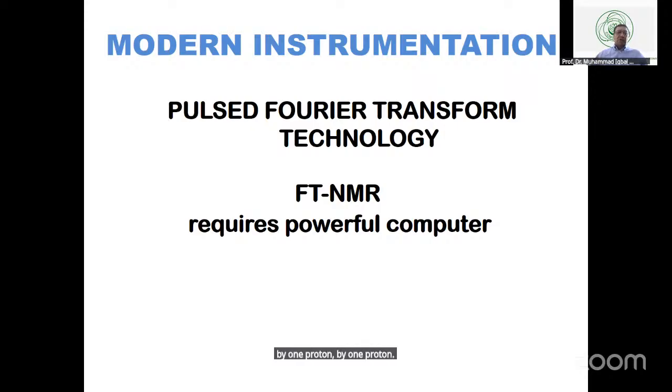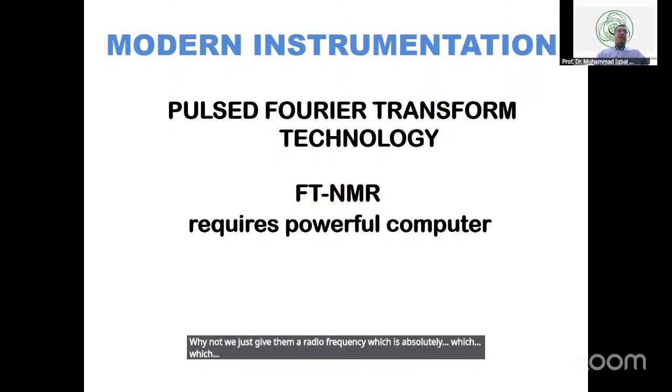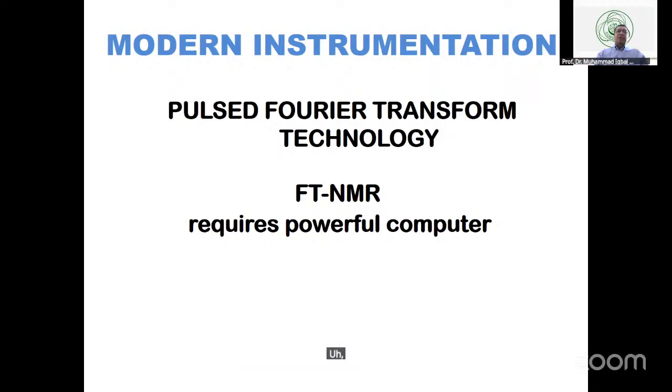Why don't we just excite them all together? Why not give them a radio frequency which all protons in the molecule absorb, and then record, instead of absorption, the relaxation, the release of energy when they achieve thermal equilibrium?